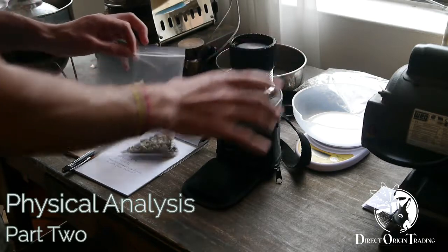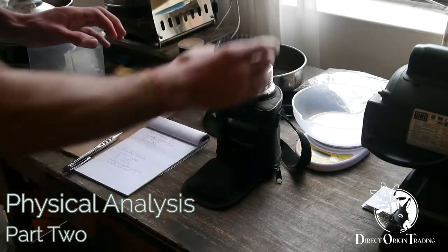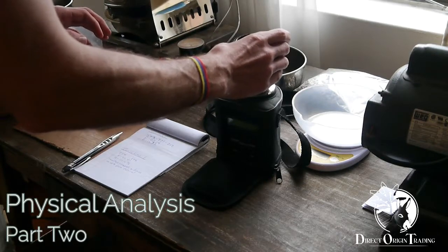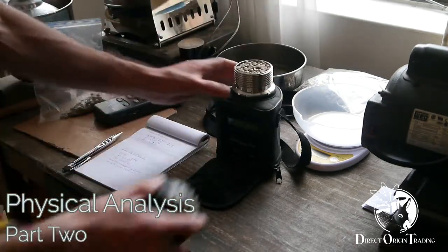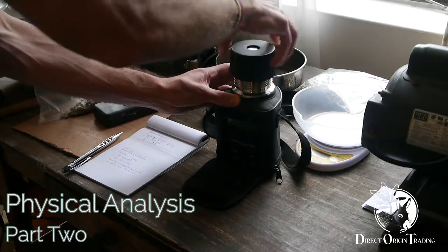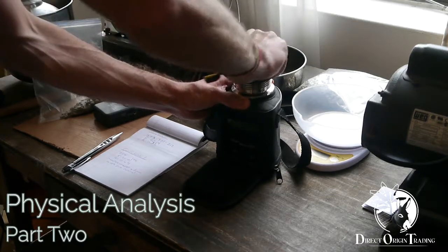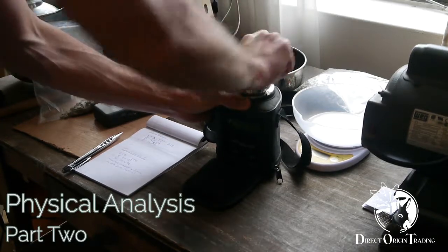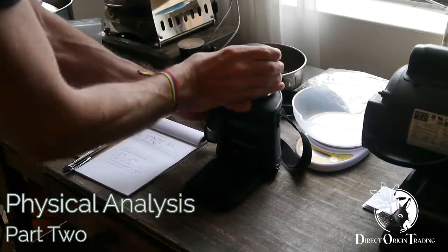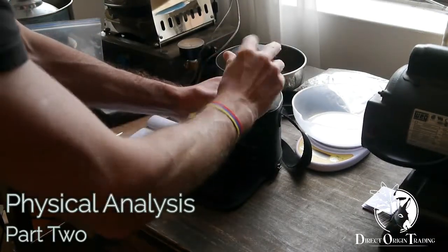So we're going to put it in here. It's best not to touch the beans themselves. You need it to be just up to the top of the meter here, of the little cup inside the meter. And get this to the pressure that it needs to be.